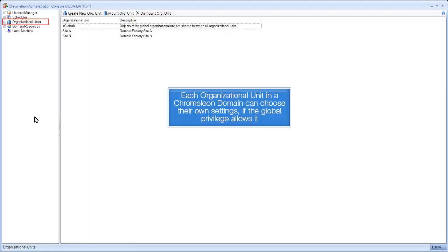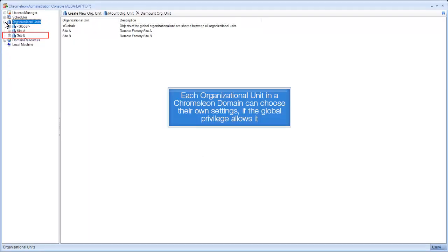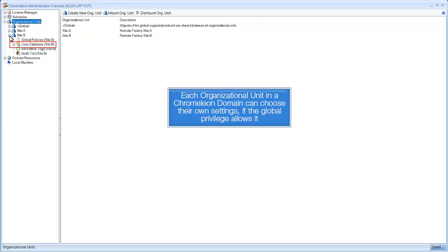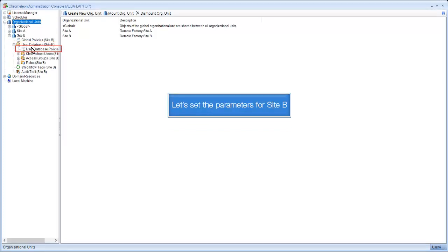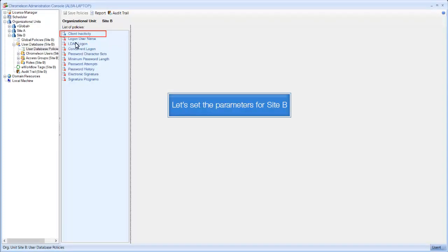Each organizational unit in a Chromeleon domain can choose their own settings if the global privilege allows it. Let's set the parameters for Site B.